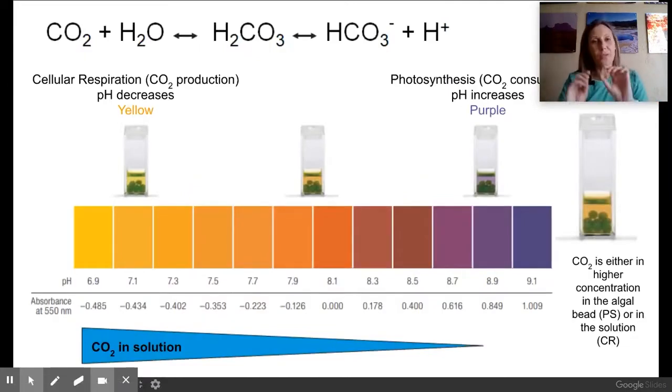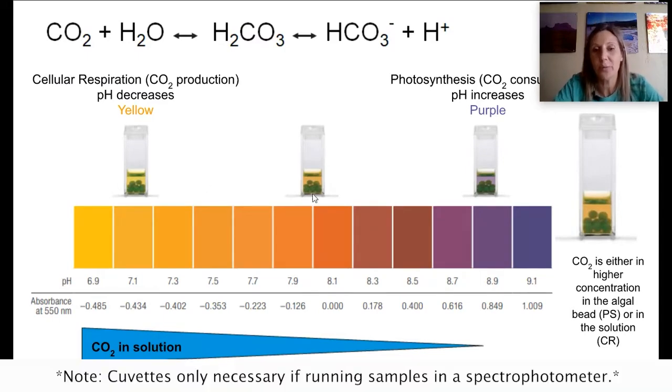You are going to get a kit with some algae beads in it, and in our technical video, I'll show you how we're going to prep those algae beads. But basically, you're going to put algae beads in a cuvette here, and you're going to cover them with this CO2 indicator solution. And then you can put them under different conditions.